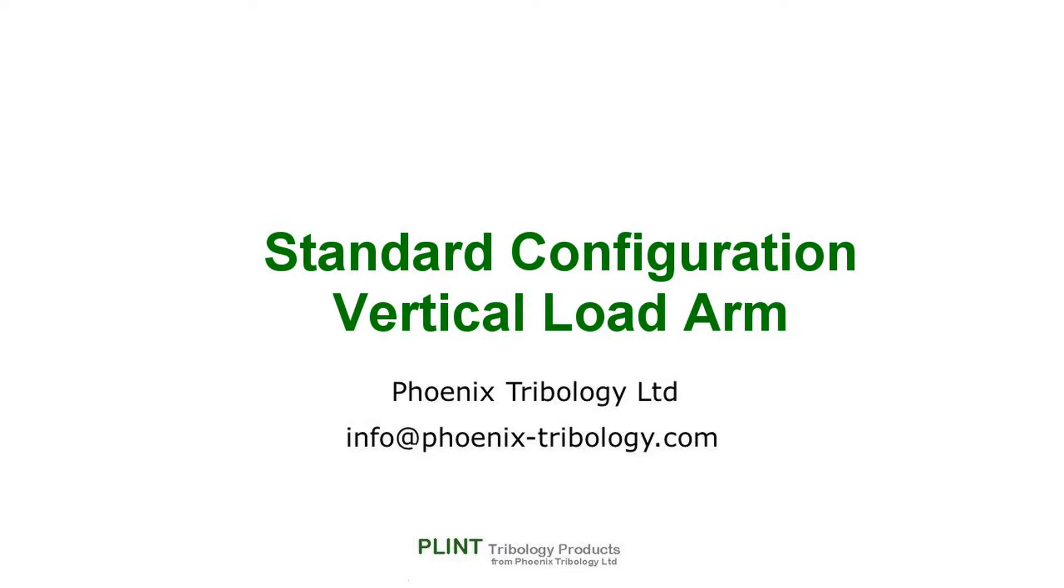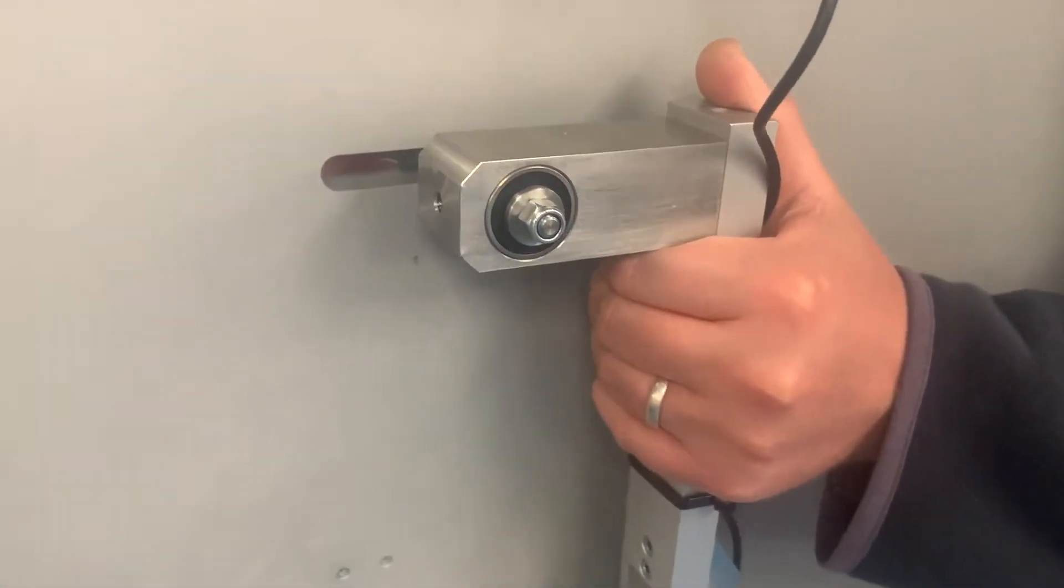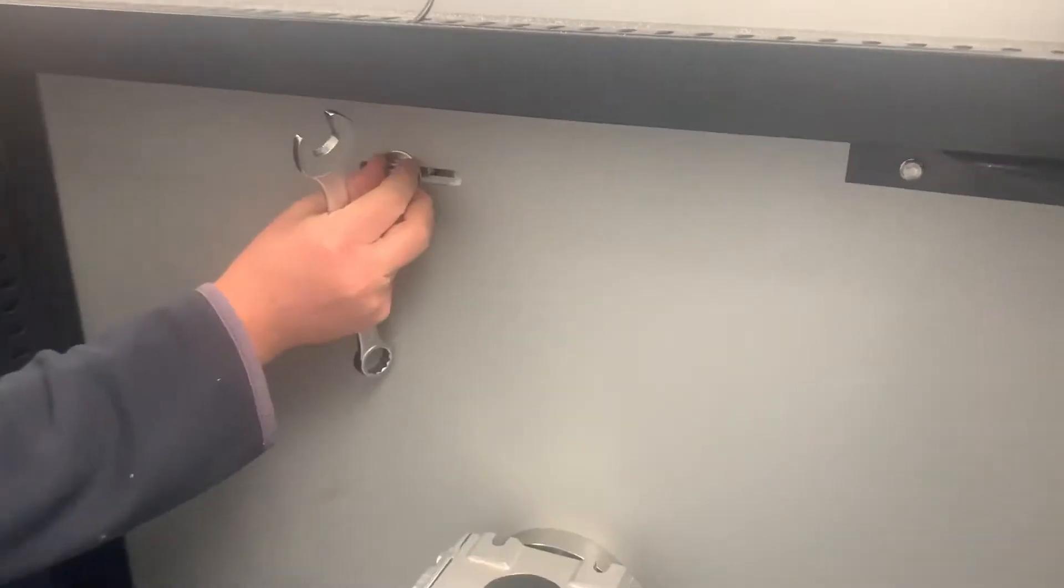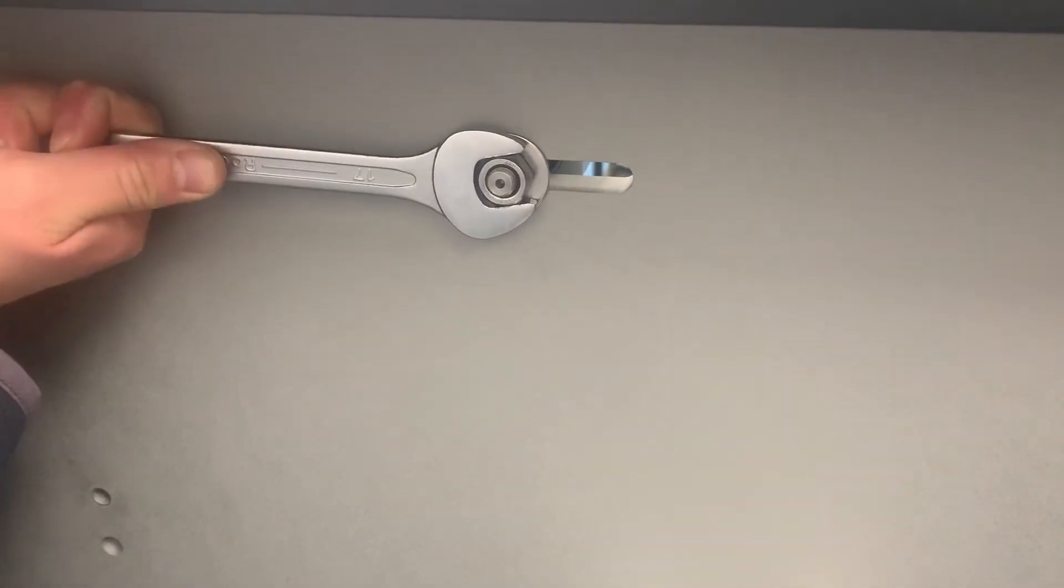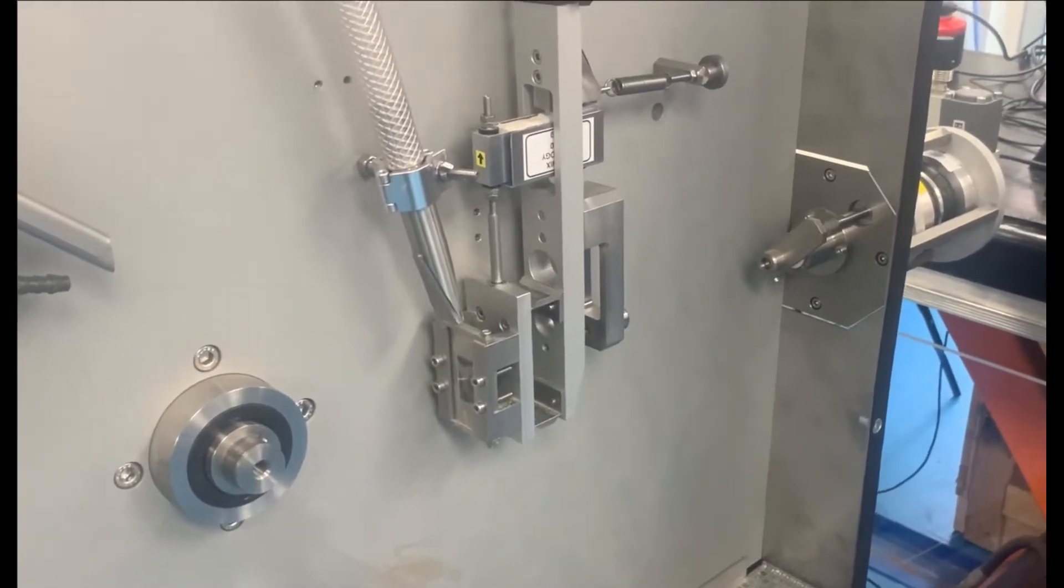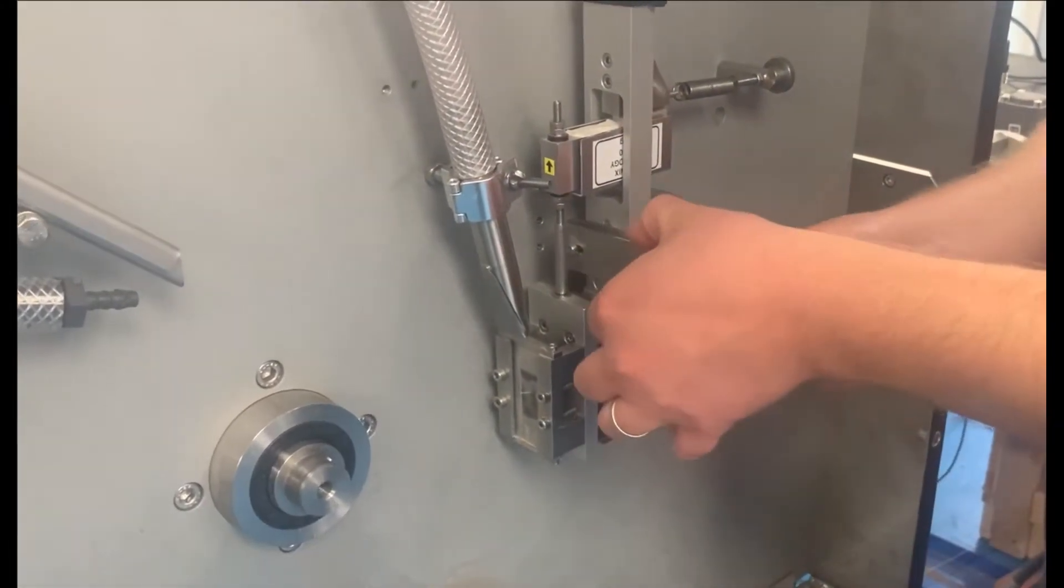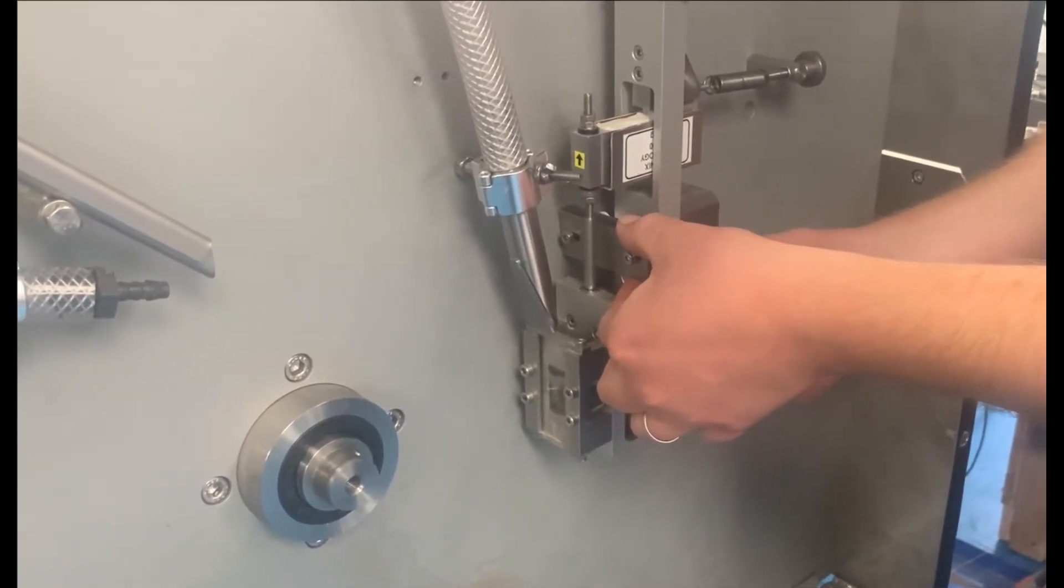Standard abrasion tests are performed with the specimen load arm in the vertical position. To install the load arm in this position, insert the load arm pivot pin in the slotted hole on the back plate and secure with the nut provided. Now fit the load arm guide block. This keeps the load arm steadily aligned with the test wheel.